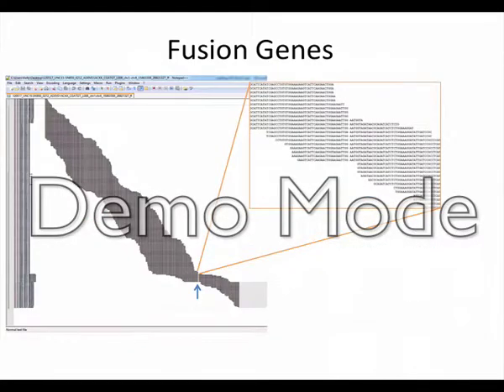Okay, so this is the output of what we were looking at, which is TopHat output. This is sequencing, overlapping sequencing data for half of a fusion gene. So you can see the sequence here, right? And then you have the second part here. So it's showing evidence of the overlapping genomic sequence. Starting, let's say this was one part of the exon moving across the exon, and then here from this part of gene 2 across.